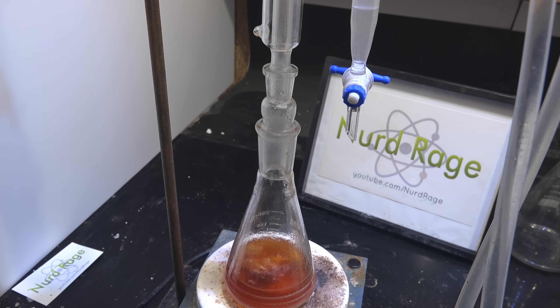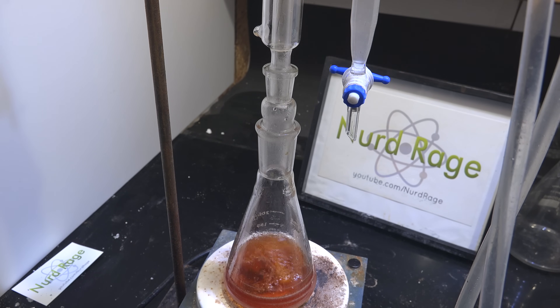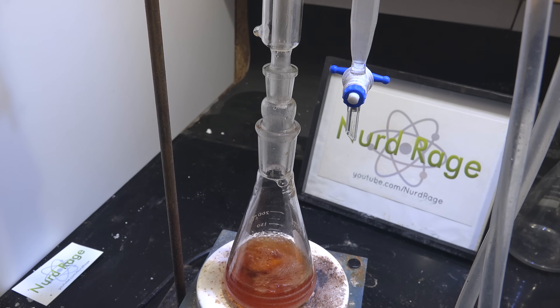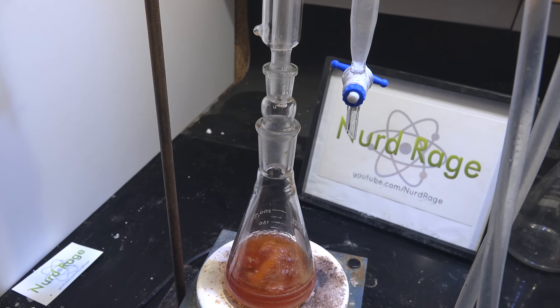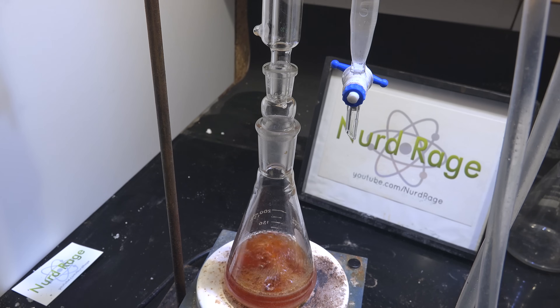Water forms an azeotrope with toluene, and the Dean-Stark apparatus lets us separate the toluene from the water and return the toluene to the mixture, continuing the cycle. For further information about the Dean-Stark trap, check the video description. Eventually all the water will be removed — turn off the heating and let the mixture cool.